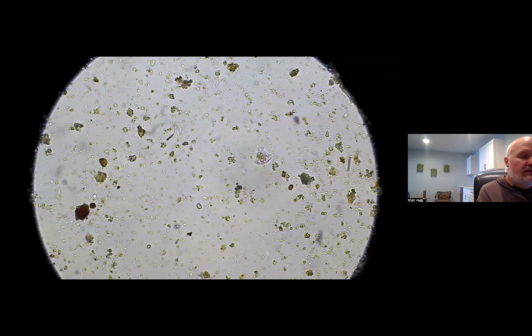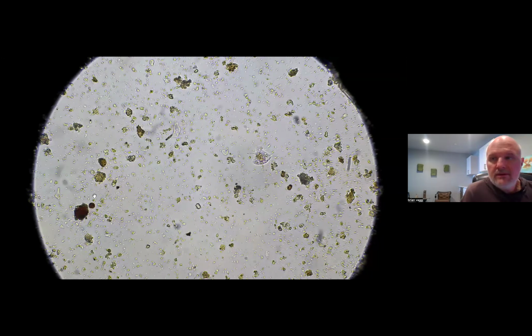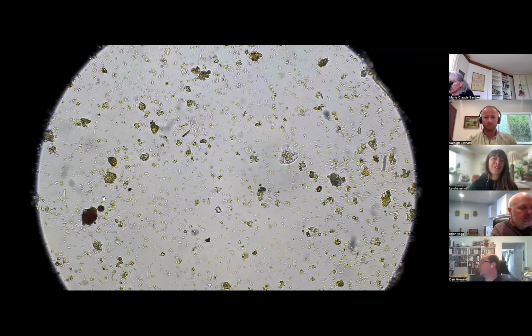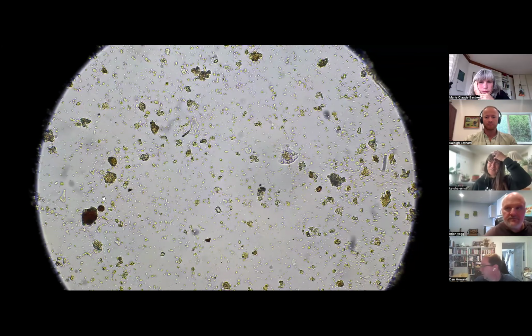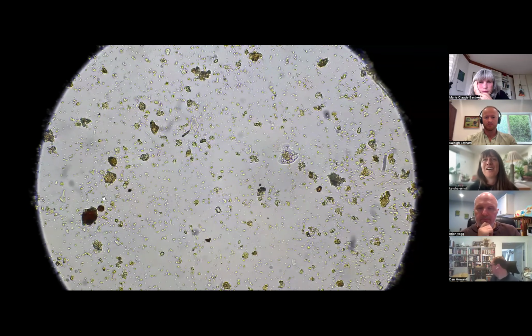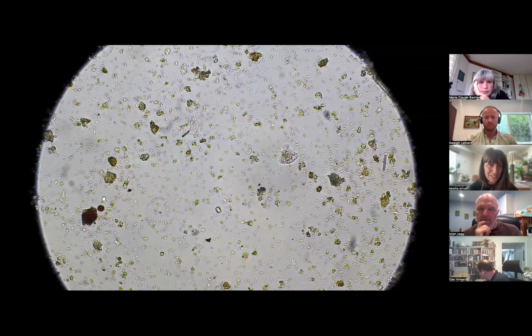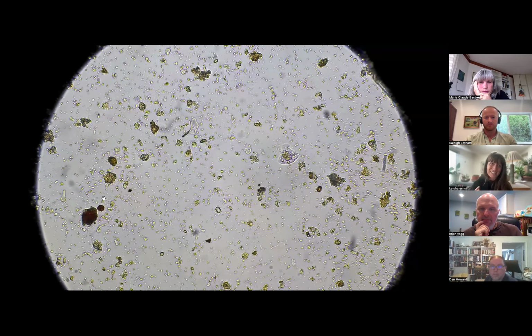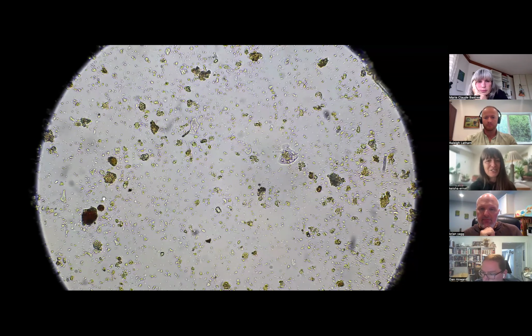Hey, Brian, could we pause for a second? I know you've got another sample, and there was a comment here about JMS, or Jadam microbial solution. This has been a conversation over the past few days with a few different people, actually. But the idea of biodiversity when we're looking underneath the microscope, and what preps are we using and what are we seeing? And I thought it was really interesting.